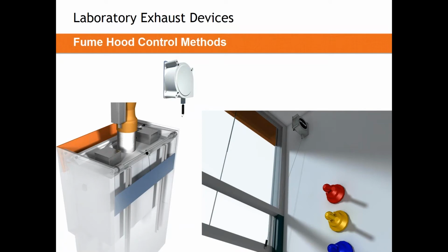This is going to be mounted to the counterweight in the back of the fume hood. If an installer has access to the hood, this is the best way to install it. It's clean, it's unseen by the user, and it's out of the way so nobody can play with it like a guitar string or cut it with a pair of scissors.